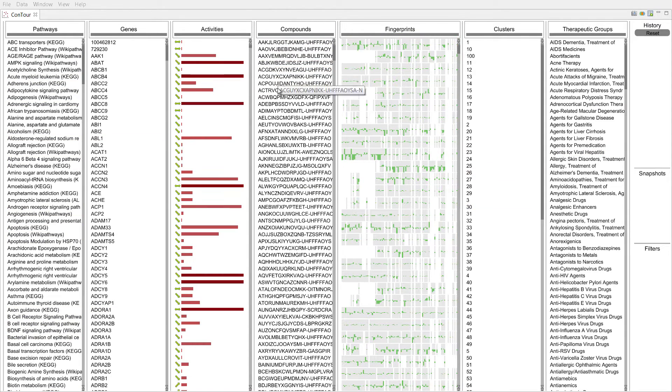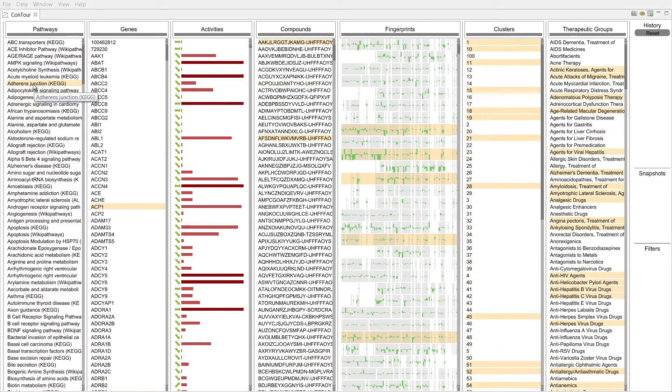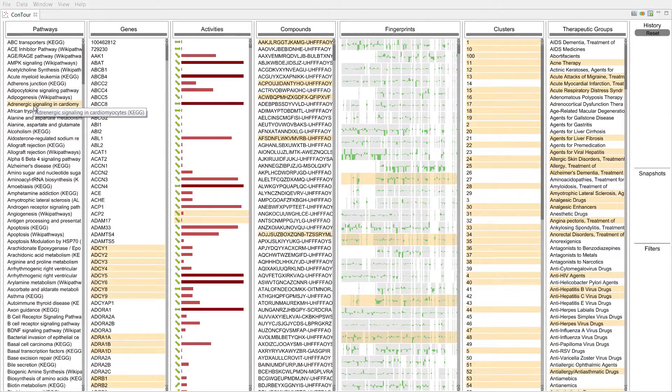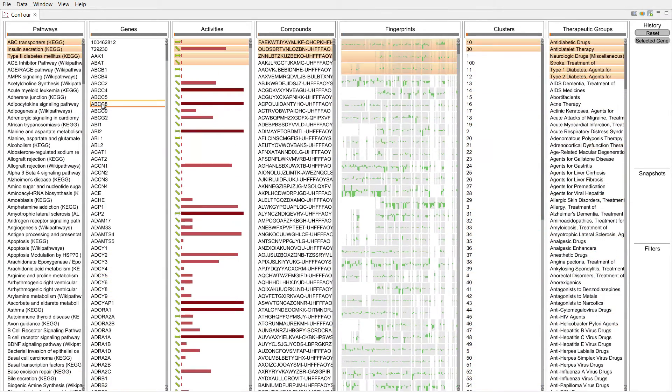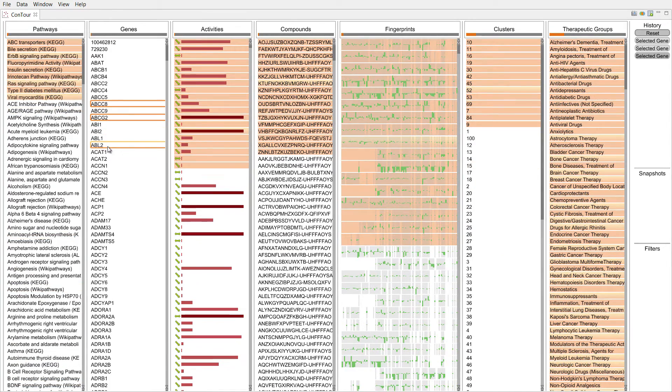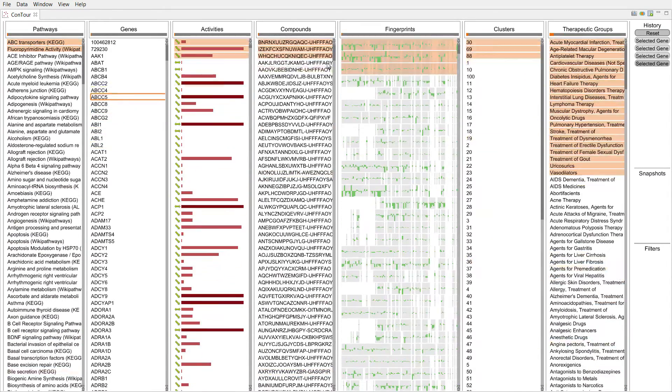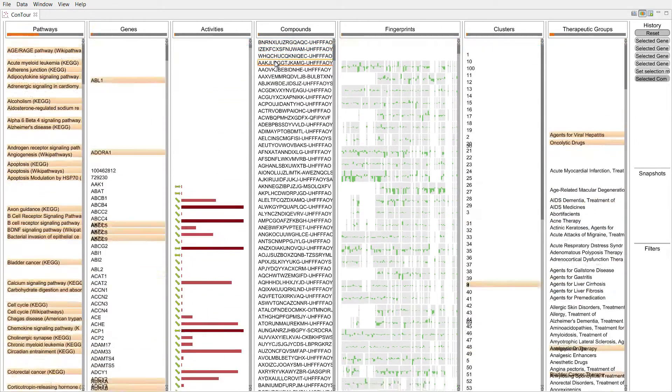Hovering over one item highlights all other items that are related to it. Selecting items moves all the related items to the top. We either highlight items that are related to any of the selected items, or only those that are related to all selected items.